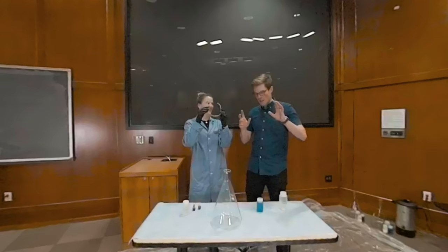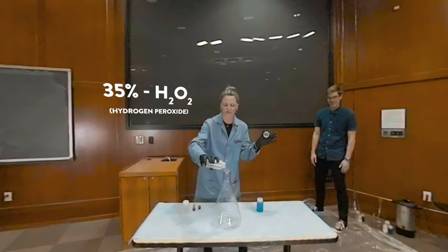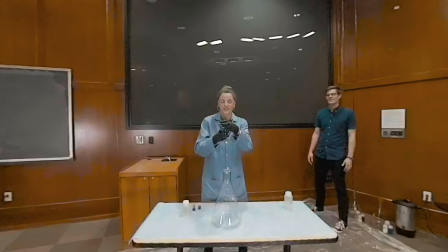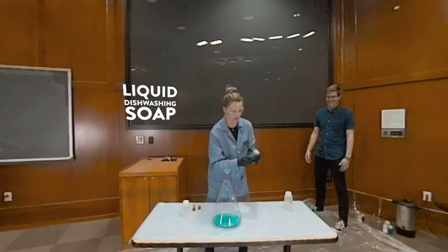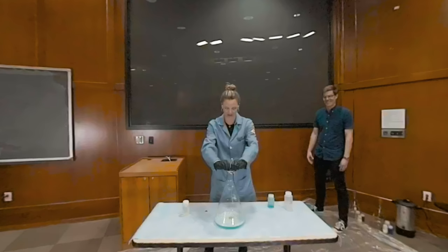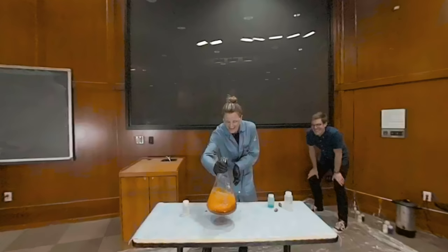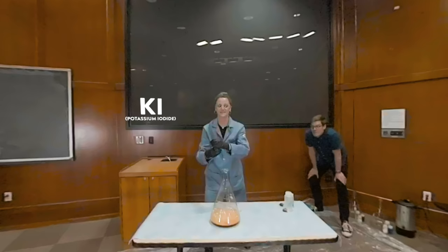I'm going to put my goggles on and my gloves on. I have a 4-liter Erlenmeyer flask. I'm going to add 35% hydrogen peroxide — at home we have anywhere between 3 to 6% peroxide, but this is Texas, so we want to be big here. Then I'm going to add some dish soap; it doesn't matter what kind, we just need some bubbles. And then swoosh — swoosh is a technical term. We're trying to make a homogeneous mixture, one phase. Now I need to add some food coloring. Since we're on the University of Texas campus, we're going for a burnt orange color — some yellow, some red. Now let's swoosh again. We have a swoosh system here. Now I'm going to add my catalyst: potassium iodide. Step back and we're going to observe our reaction. Here we go.